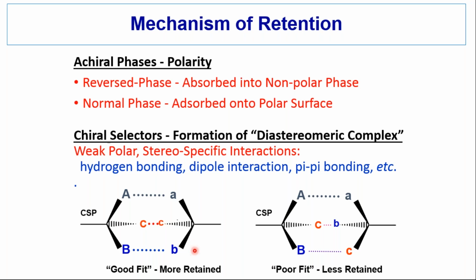We have more interactions. Think about in achiral reverse phase chromatography, we deal with the dreaded secondary interactions, such as the interaction of amines with silanols. We try to disrupt that secondary interaction. Here, we don't have secondary interactions, we have tertiary interactions at a minimum. Sometimes we have quaternary or higher levels of interaction. We have 4, 5, 6 chiral sites that may interact with the isomers. We need at least 3, but we sometimes have more. So there's always a possibility of having, say, a sluggish off rate with one of these interactions.